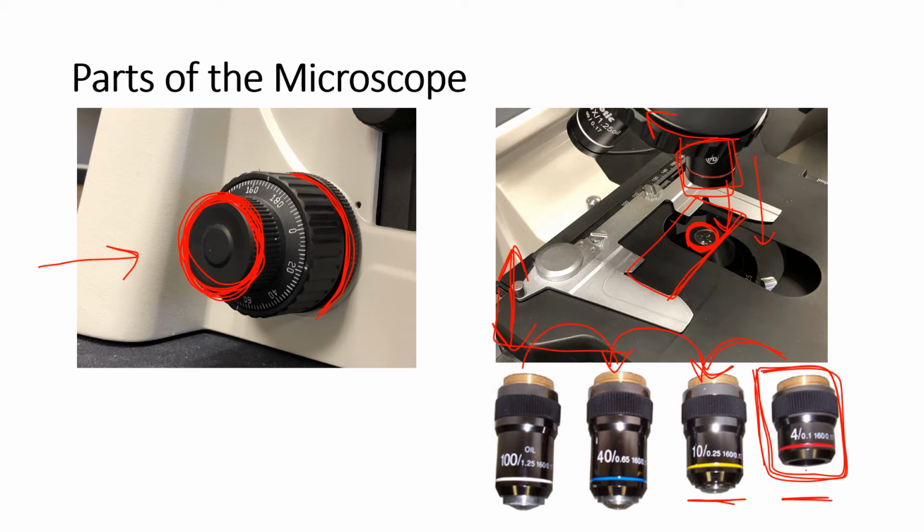Then the last one, you will use the oil. I'll talk about specifically how to do oil immersion in a little bit. But again, as you switch to the oil immersion lens, you are only going to use the fine focus.